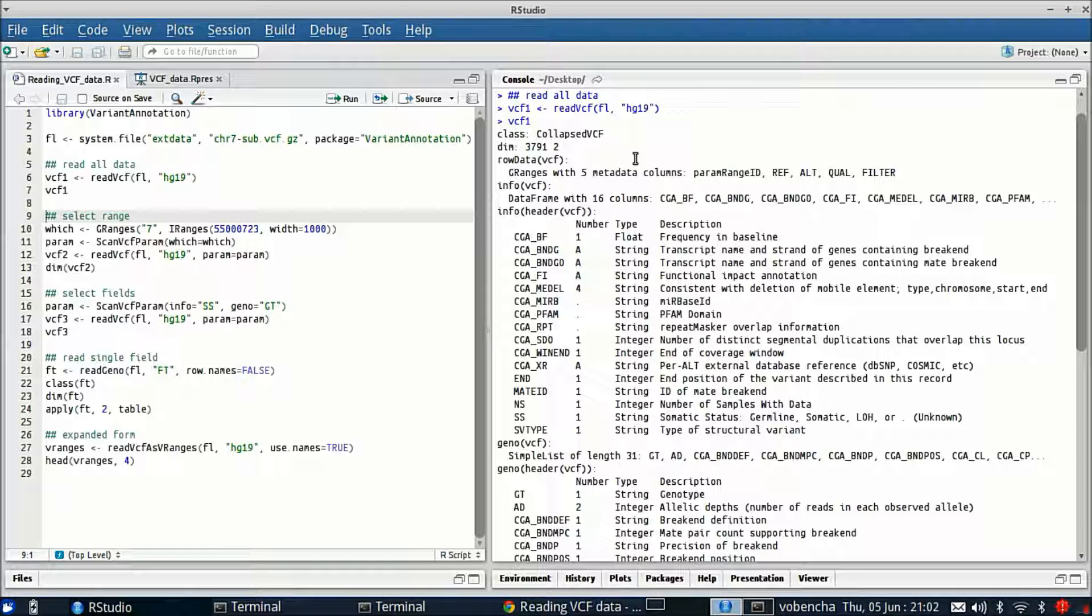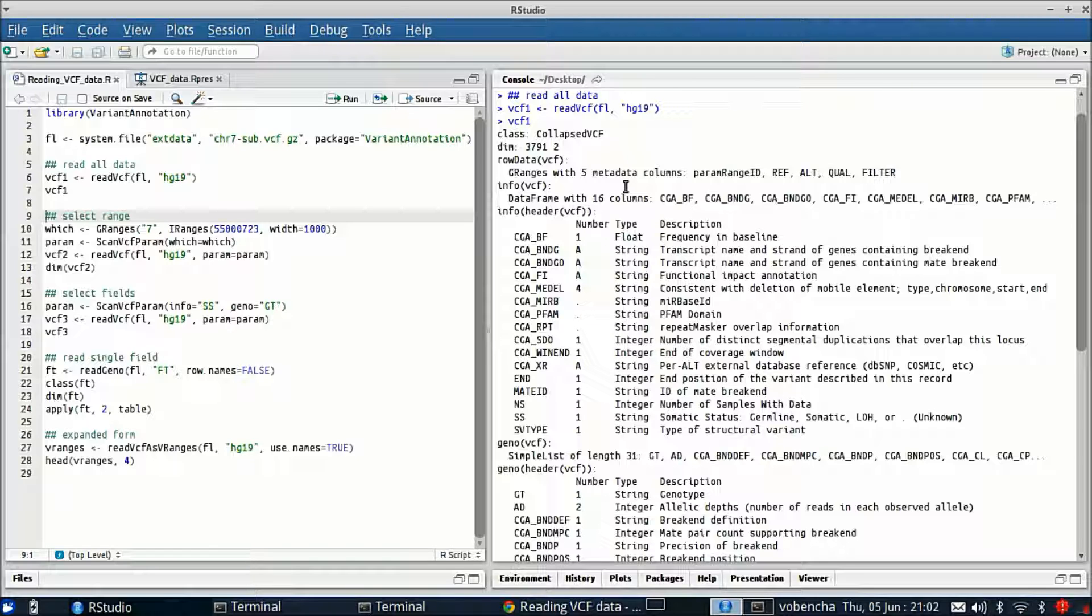The first one is this row data slot. This is a GRanges containing the ranges of the variants and the reference and all the alleles as the metadata columns. The info slot is a data frame with 16 columns and we can also access all of the header information that came from the file. It's been parsed and put into this VCF object as well.